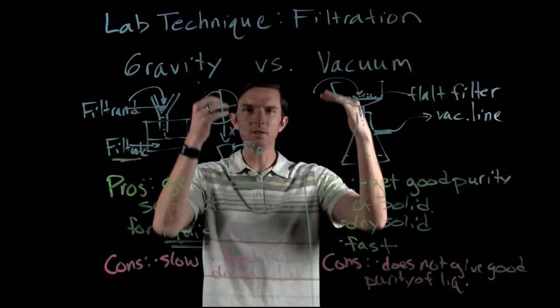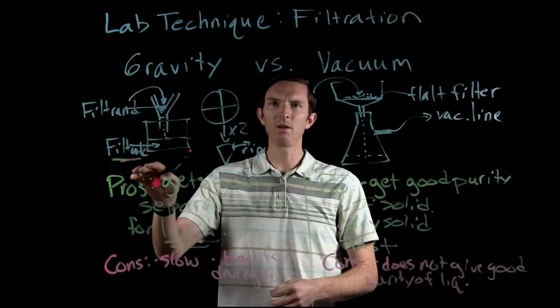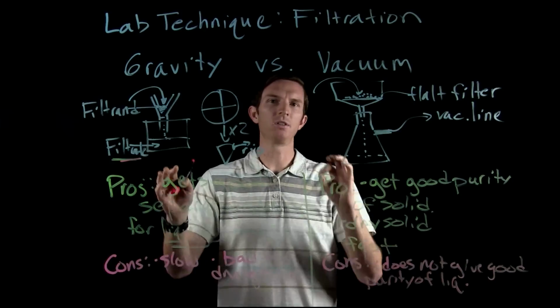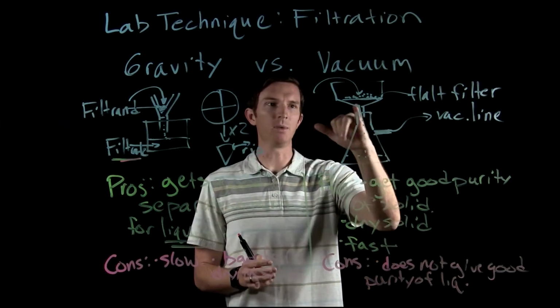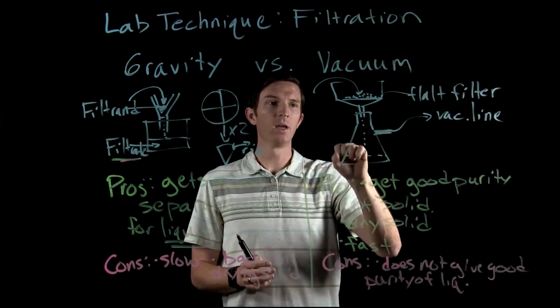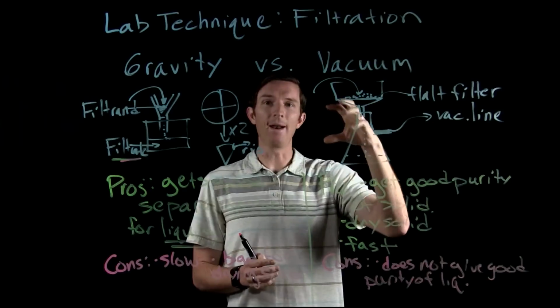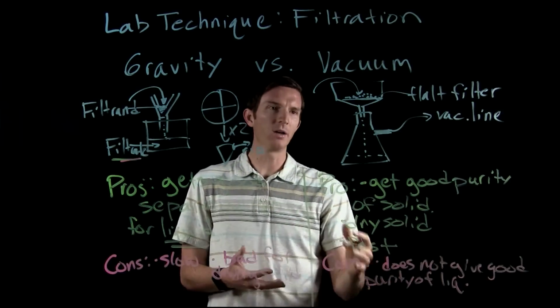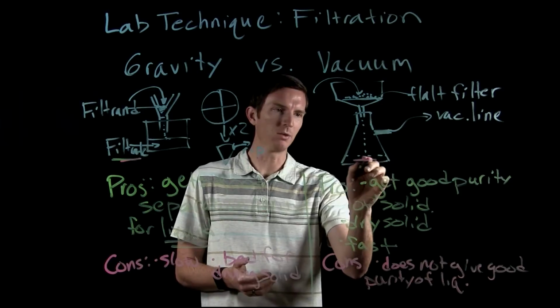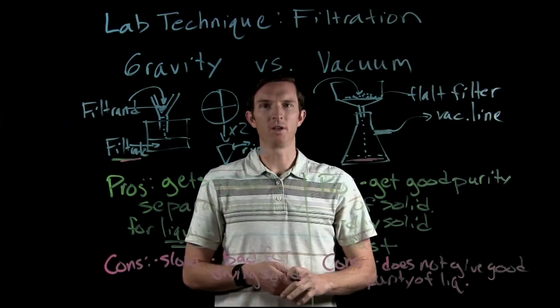If we're going through our synthesis technique and we really want this filtrate, the liquid that goes through, vacuum filtration is not that great because we can sometimes get some impurities that were left over in our filter. Maybe when we're pulling this through, we're aerating our liquid, and that's not helpful. Also, it's not good if we have a small amount of liquid left. If we have a small amount of liquid, vacuum filtration is not great.